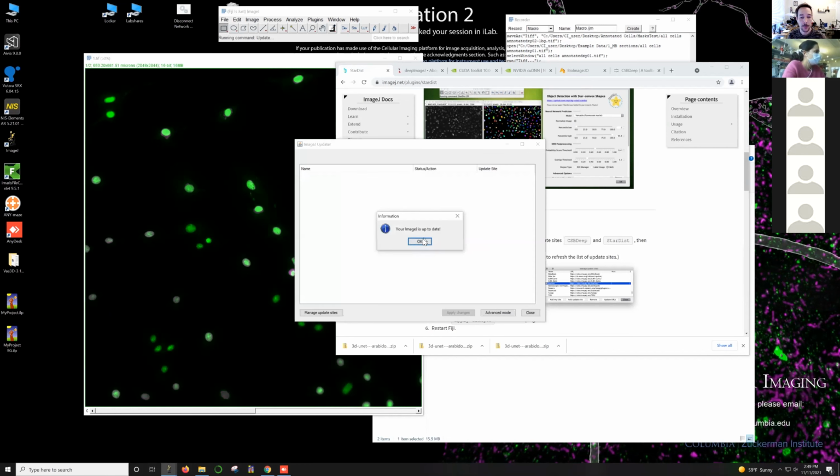And you don't have to have a GPU to use this. We'll go through this in a minute, but you need a GPU for doing the training and to run these things quickly. But even if you're just on a laptop without a good GPU or an NVIDIA GPU that can do this type of work, you can still run these tools on your CPU.